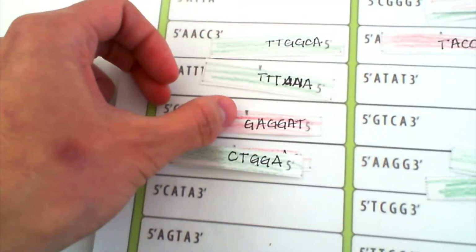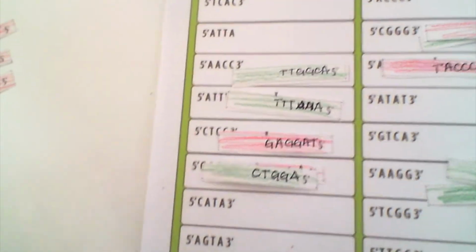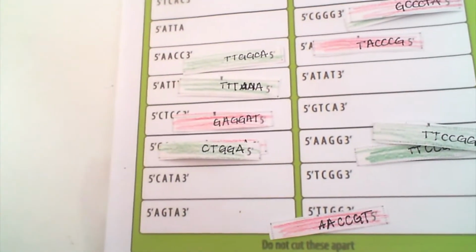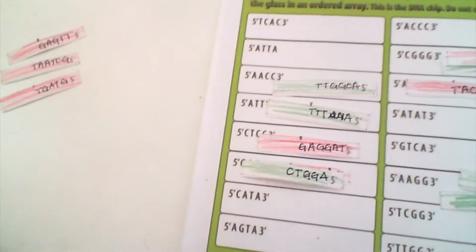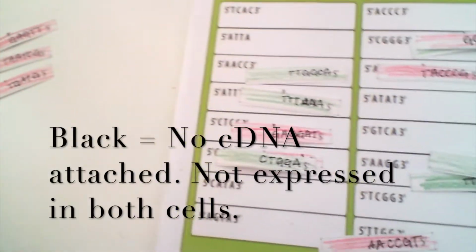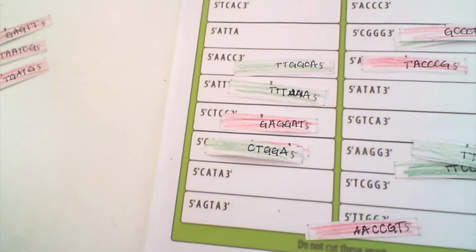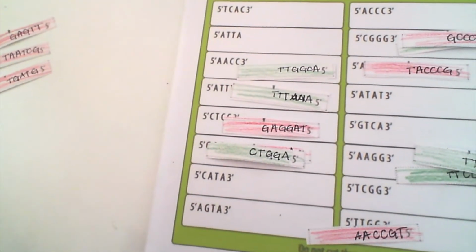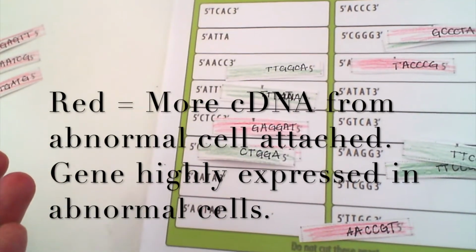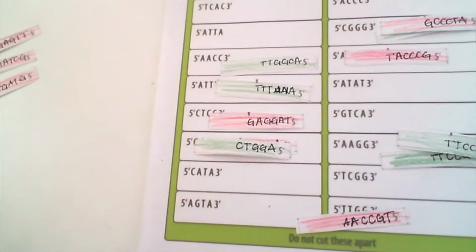Okay, so I'm going to have you kind of predict before I actually show you. I highly recommend that you pause the video after I ask you the question. So here is our microarray. Remember the colors: we have black, we have green, we have red, and we have yellow. Remember, if they're black, it means both sets of DNA are not turned on. If it's yellow, that means it's equally expressed in both sets of cells. If it's red, that means it's overly expressed in the cancer cells or the plant that was grown in the dark, because that was the condition for that.